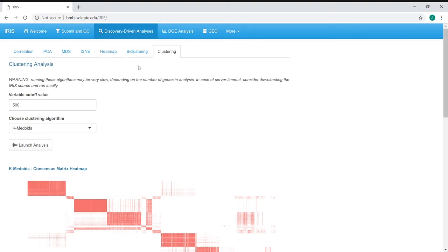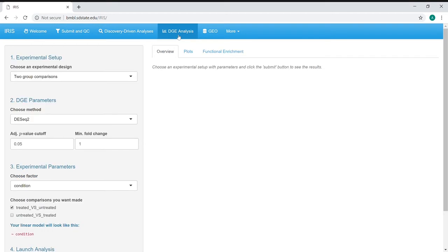Once you've explored the data in the discovery driven analysis section, the next part would be the actual hypothesis driven information, mainly in the form of differential gene expression analysis. Going to that DGE tab, what we can see is the experimental setup of our comparison.